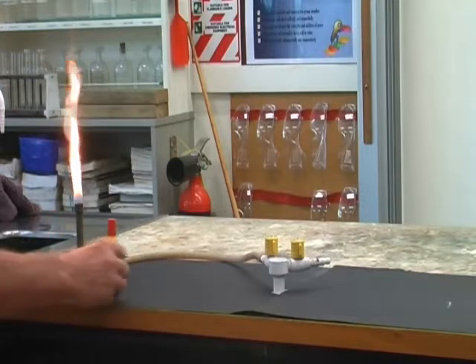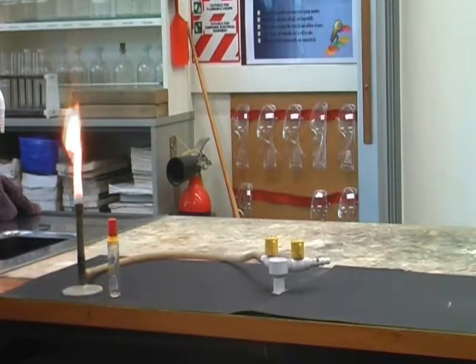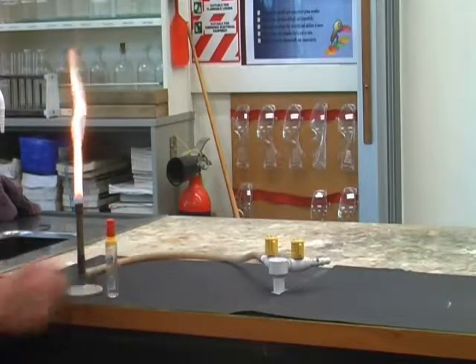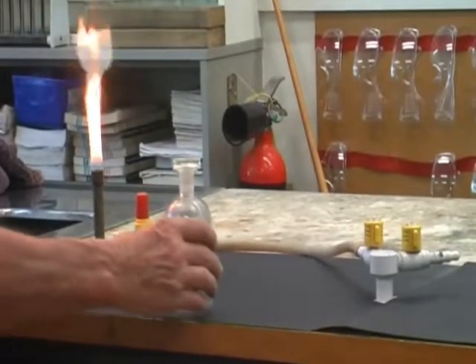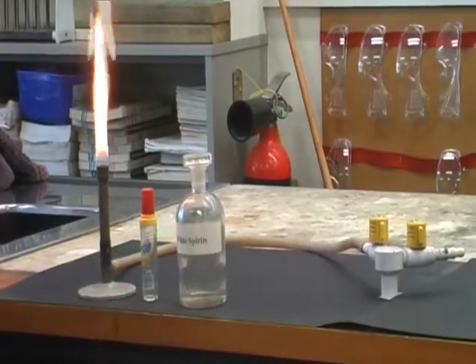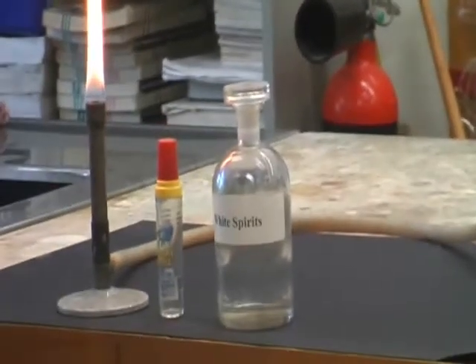Here is the next one. This one is butane, used in lighters and so on, and it's a liquid under pressure. The next one, so that's about 4 carbons. When we go to 5 or 6 carbons, we have a chemical called white spirits, which is used in camping stoves, and it's got quite a low boiling point.